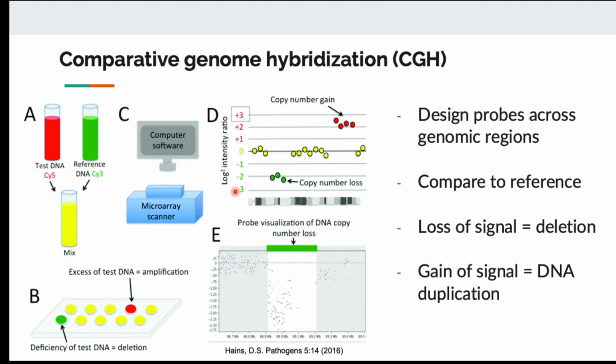We want to know if the patient with that disease has a certain deletion of the genome or copy number variation of the genome. Some region might be duplicated, some region might be lost. We want to compare between our patient and the control. How can we do that with microarray? Instead of designing the oligonucleotides for exons, which we use to monitor gene expression, we design them against every region of the genome, on every chromosome.